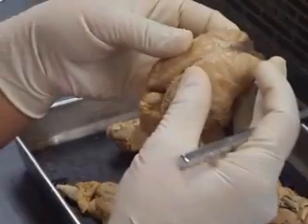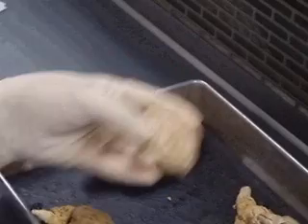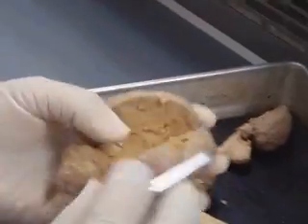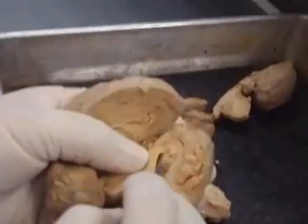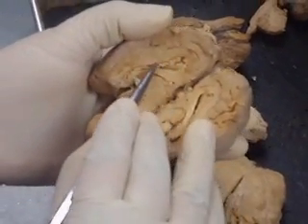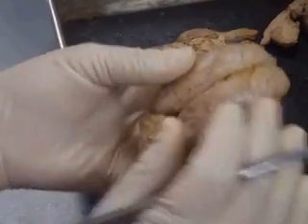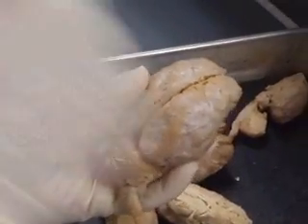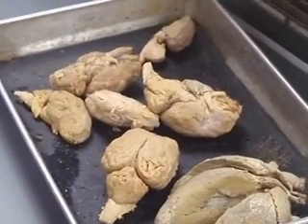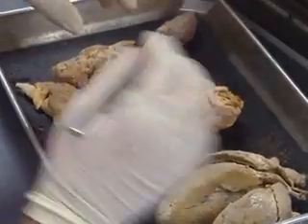You can't really see it just by pulling these apart here, but the corpus callosum is this layer right there. You see that I'm pushing down? This is actually connected to that side there. So this corpus callosum connects the 2 halves of the cerebral hemisphere, and it sends communication from one side to the other. You need to know there are lots of functions in here, so you need to know what function does what, and all the extra information in there.